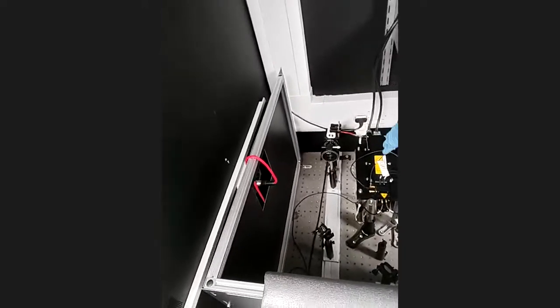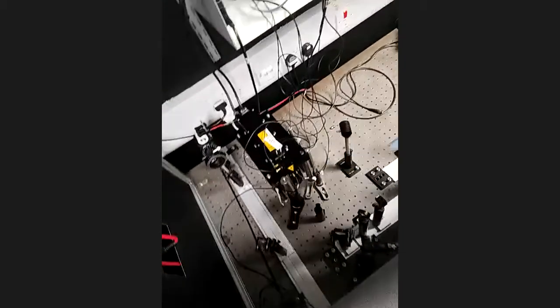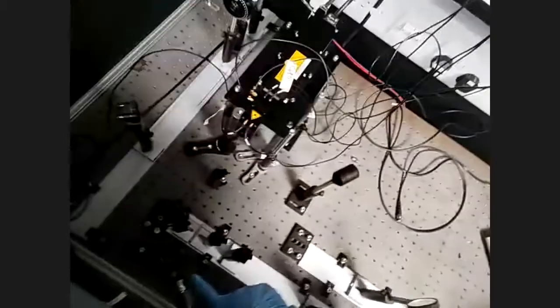So we have an ultrafast, high energy UV pulse laser, and we send packets of UV light through these optics, right? We use this little detector to monitor the stability of the beam, and then that's directed by these optics, collapsed down by this lens onto this sample delivery tube. So the sample's pumped from the chromatography system through, right?